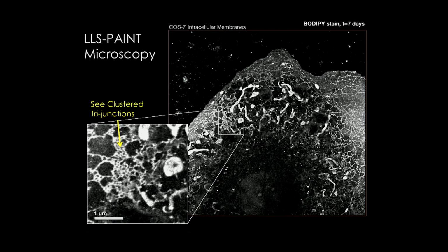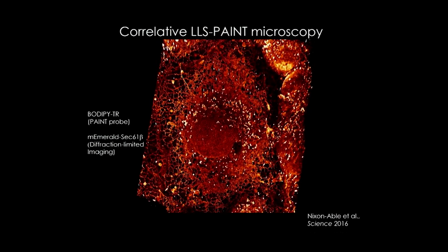And so what we can do with this technology is superimpose our distributions of fluorescent proteins that we've specifically genetically engineered and tagged onto our fluorescently acquired image using this lattice light sheet system to dock in where these proteins are localized.